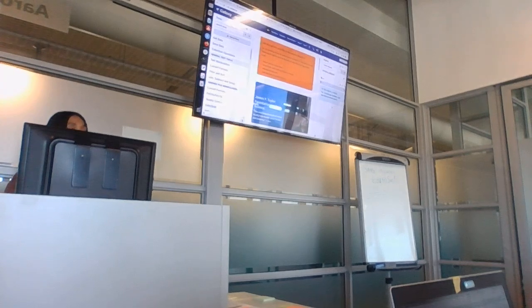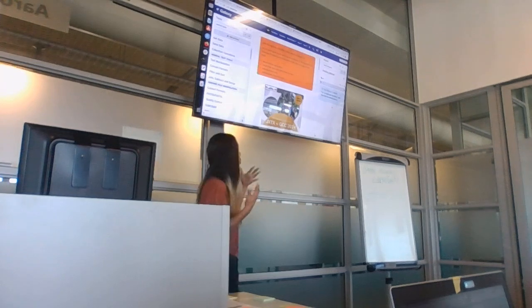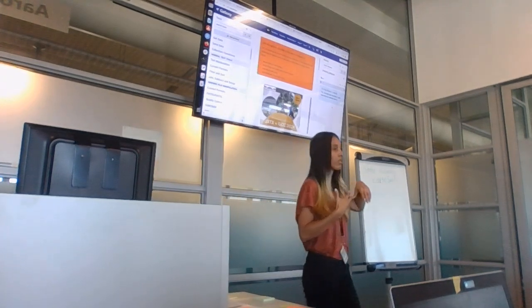So I want you to import the data that you've downloaded earlier from Zenodo, that is on your local machine. Can you figure out how to import it into this new history that you've created? Where would you go?